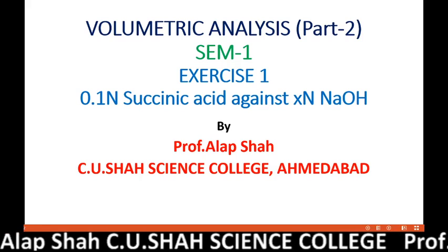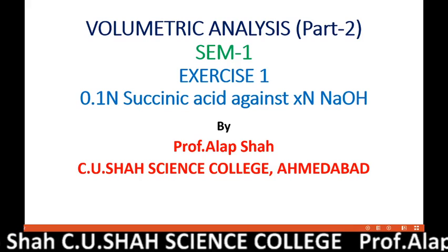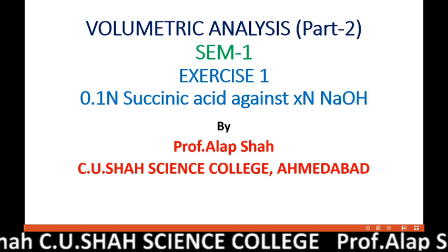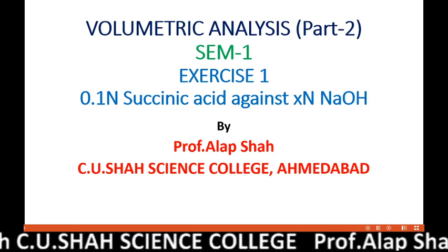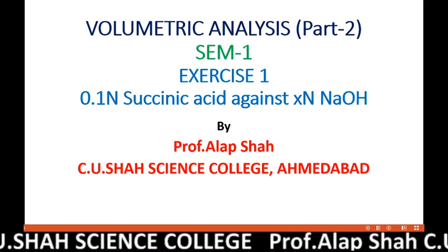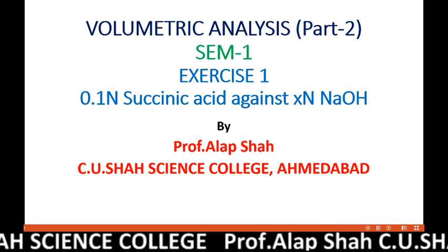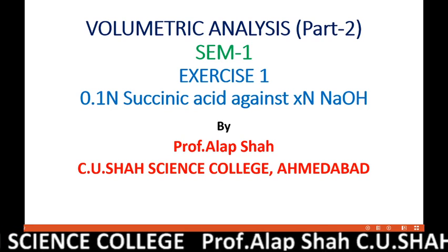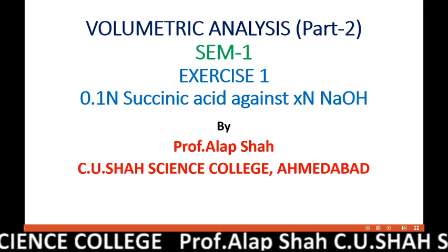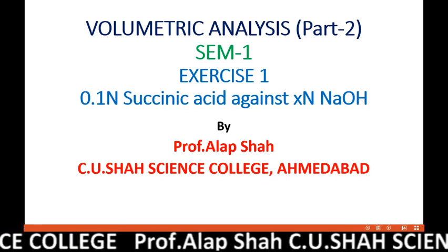Hello everyone. In part 1 of the volumetric analysis, I discussed how to prepare a standard solution of succinic acid, how to calculate the required weight of succinic acid, how it should be dissolved in a measuring flask, the very important points to fill the solution into the flask, and how to use the weighing scale.